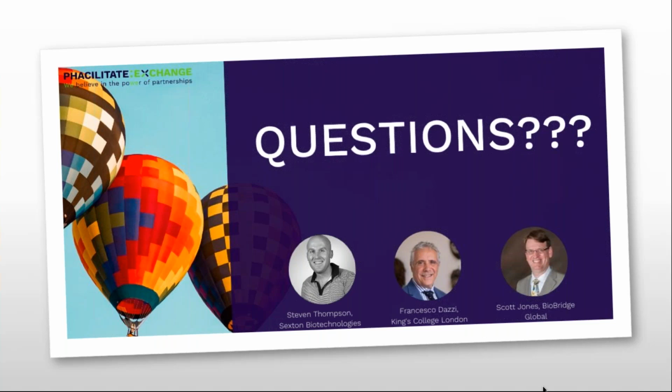So I think from our side, Scott, at the moment there are multiple automation platforms out there, and they tend to be single units and very modular. I think what is really required moving forward is flexible automation that allows you to integrate different components of a manufacturing system together.